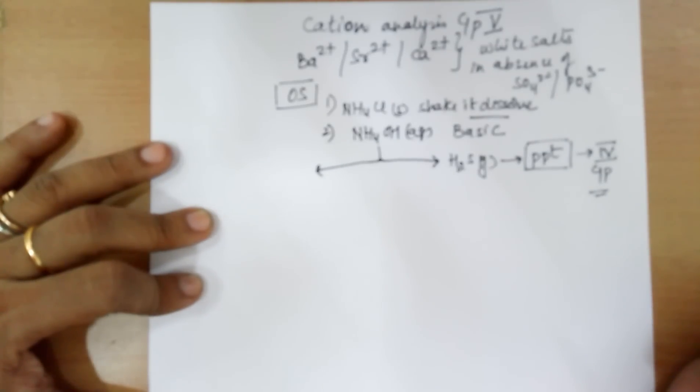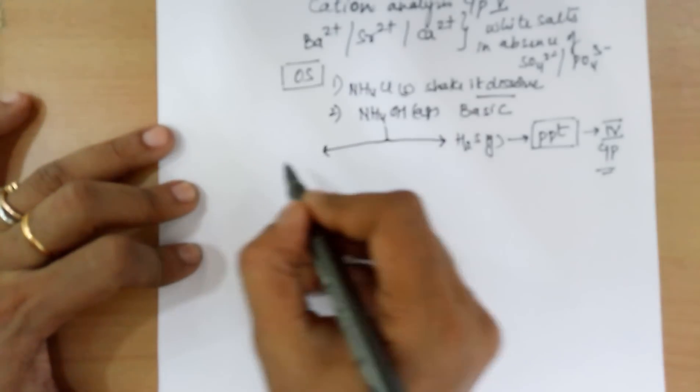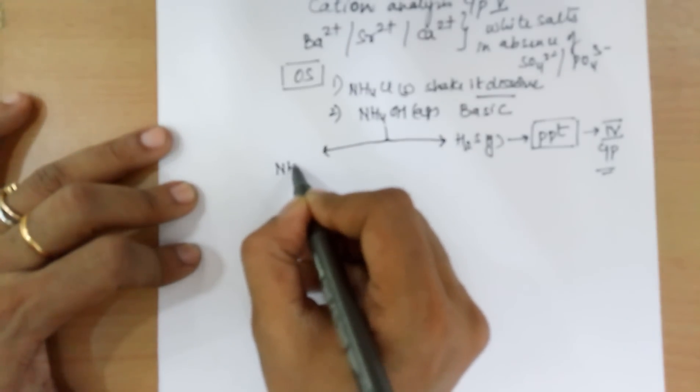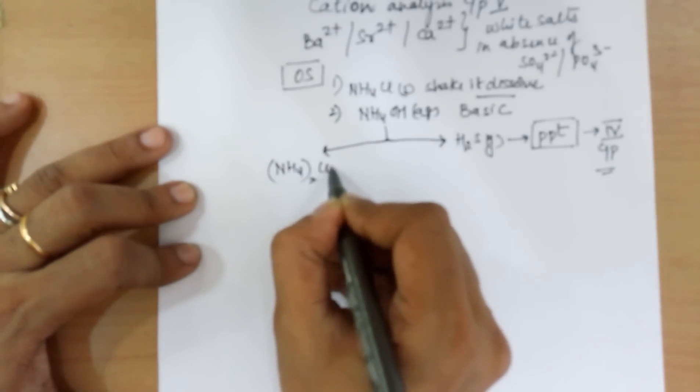But right now, since we are doing group 5, I go to the other half of it. In the other half, you can add ammonium carbonate solution.